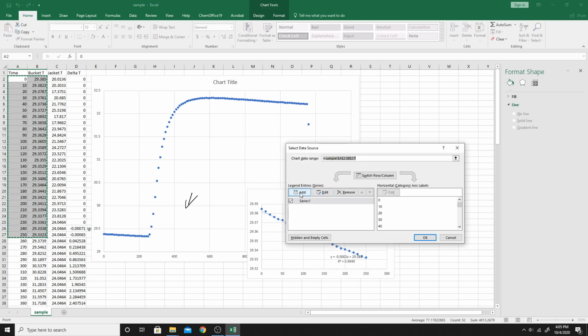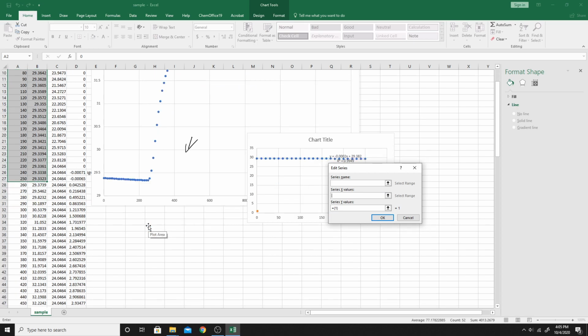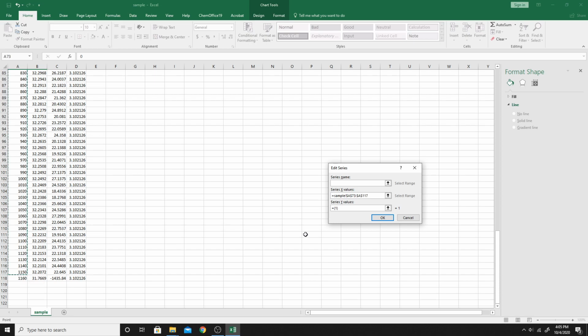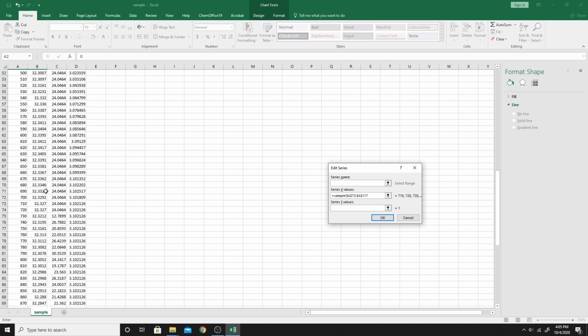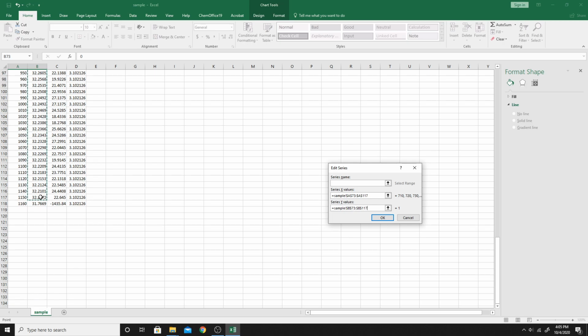and you add another series. You don't need to type the name, just go to X. So we know it's 710, so start from 710 to exclude the last data. Remember, it's an outlier, so choose the X range from 710 to 1150, and then go to Y. Okay, find the temperature corresponding to 710. So 710 is here, and then go down here.